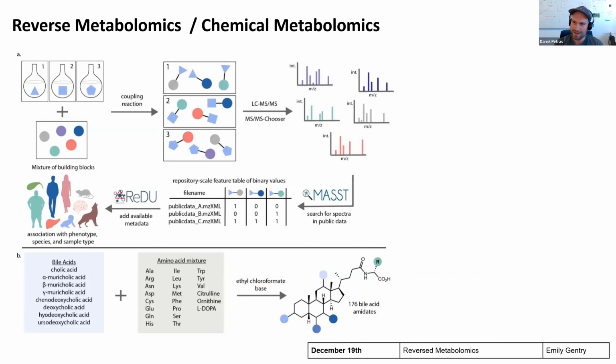And then last but not least, we also want to talk about reactivity and synthesizing metabolite libraries. There I'm very much looking forward to having Emily Gentry talk about reverse metabolomics. This is one of her big projects that she did during her postdoc in Pieter's lab and now in her own lab, where she synthesizes libraries of new metabolites and then uses repository-scale tools to match those MS spectra to real biological data to find out which of those are actually real.